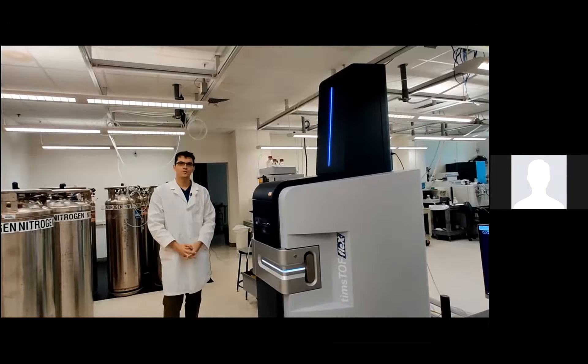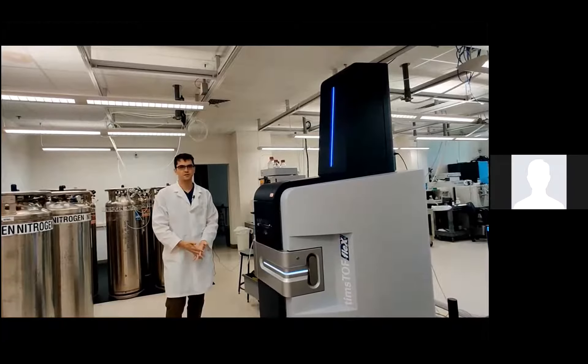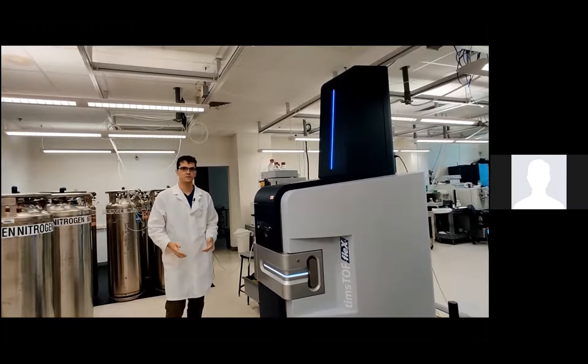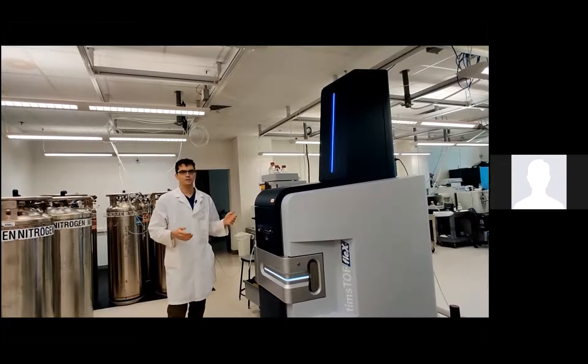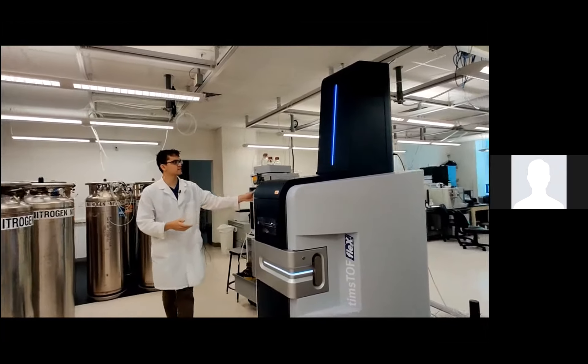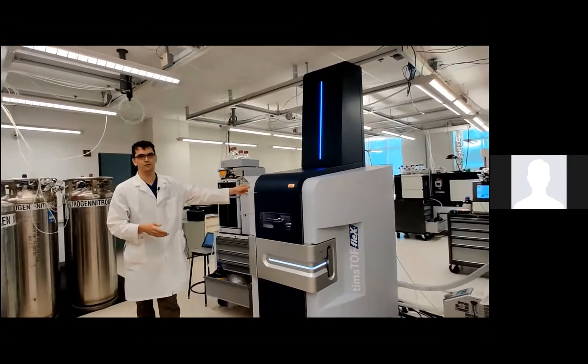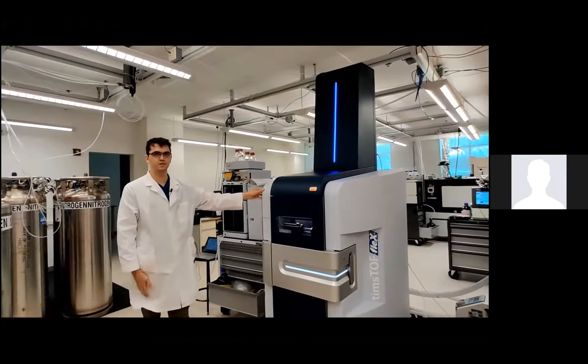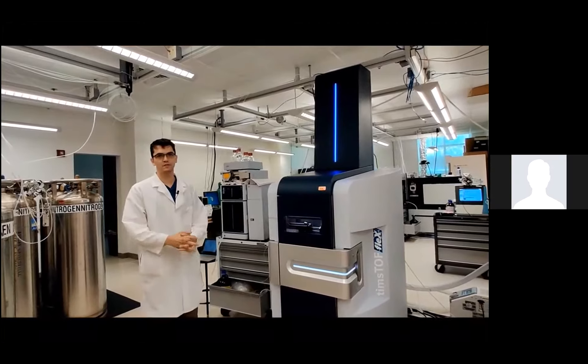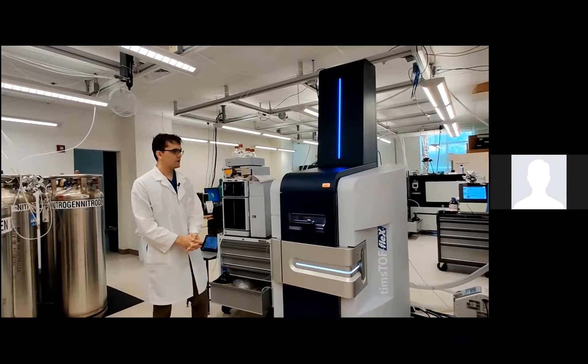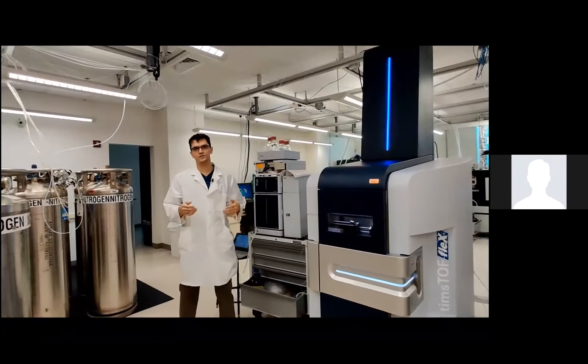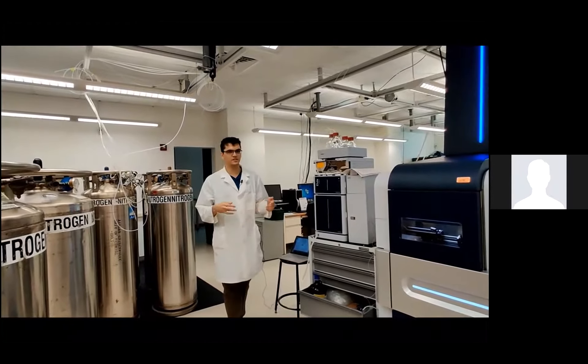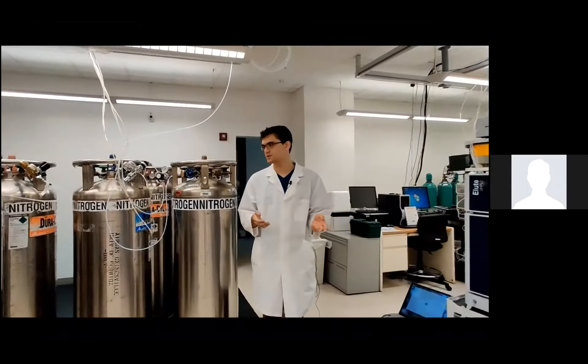Welcome to the University of Florida's ICBR mass spectrometry lab. This is the Timstof Flex. It's the mass spectrometer by Bruker that I'll be using to show you untargeted metabolomics. I'm just going to demonstrate the routine setup and cleaning, calibration, and all that that I do before I start any mass spectrometry run.